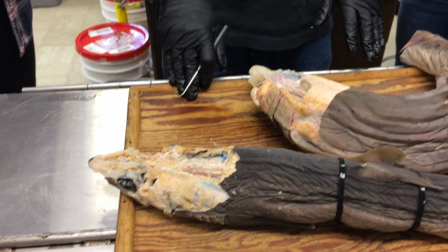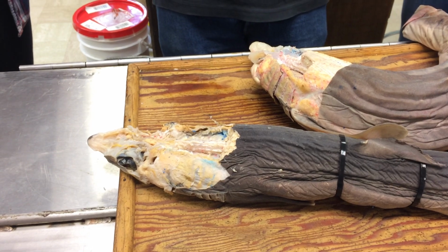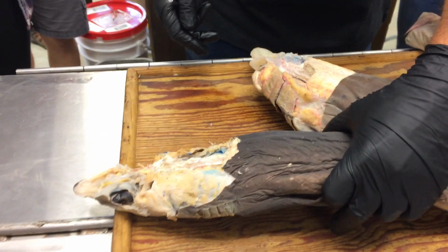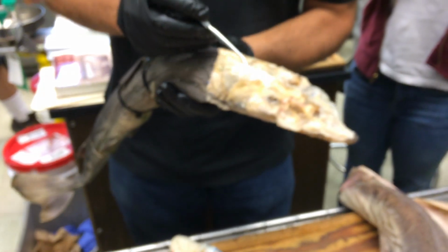Okay, and then we'll do cranial nerves. And I don't want to go through all the structures, but I just want to do the big picture orientation of the brain. And I think this one is actually going to end up being a little more convenient just because it's a little bit more highly dissected.